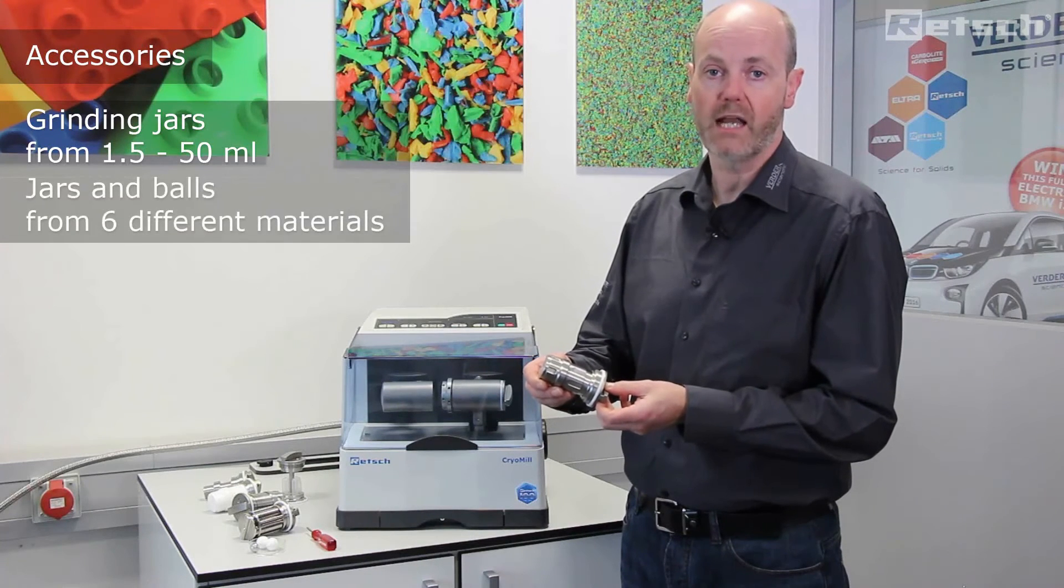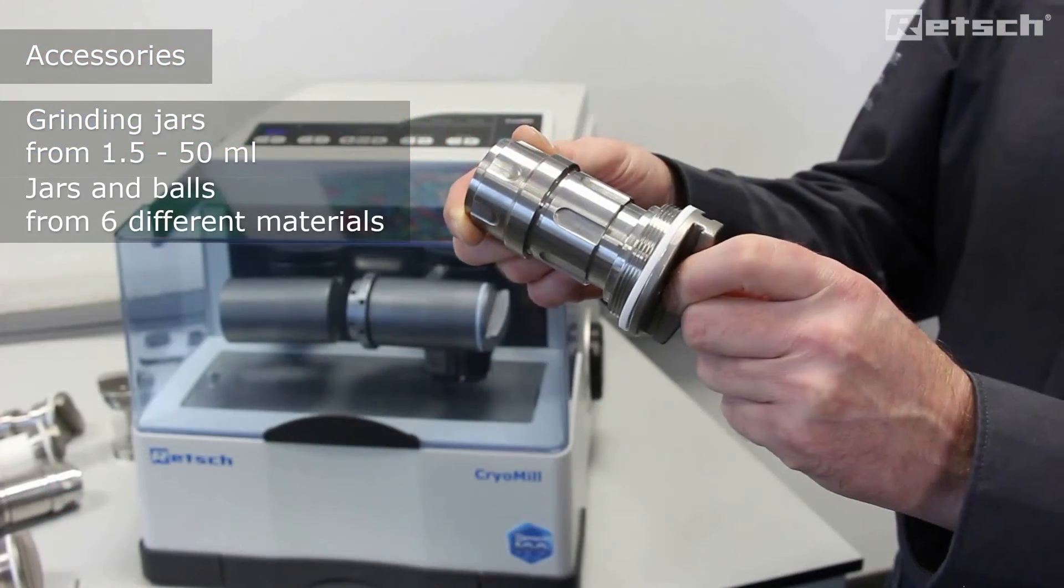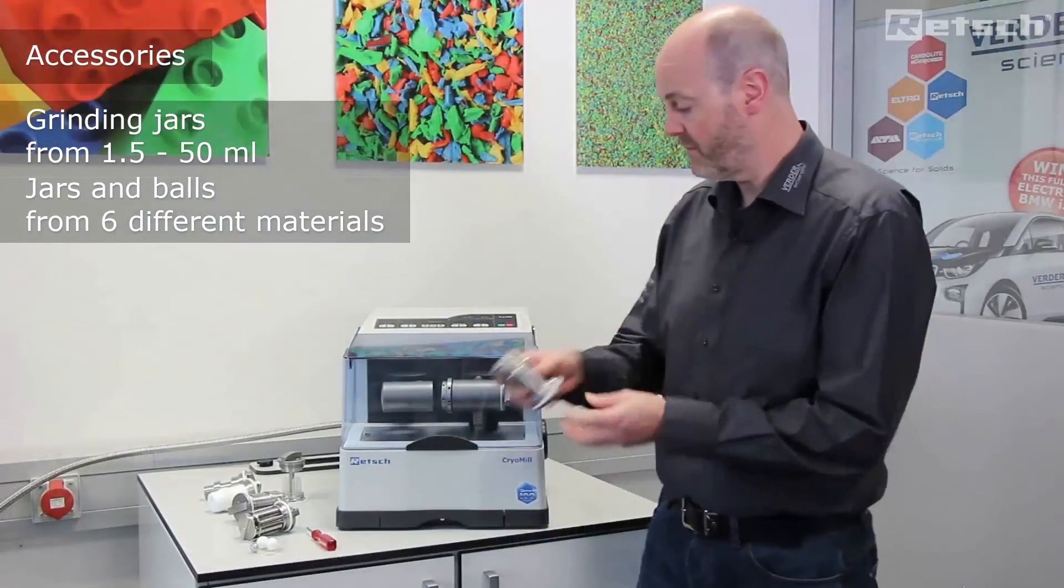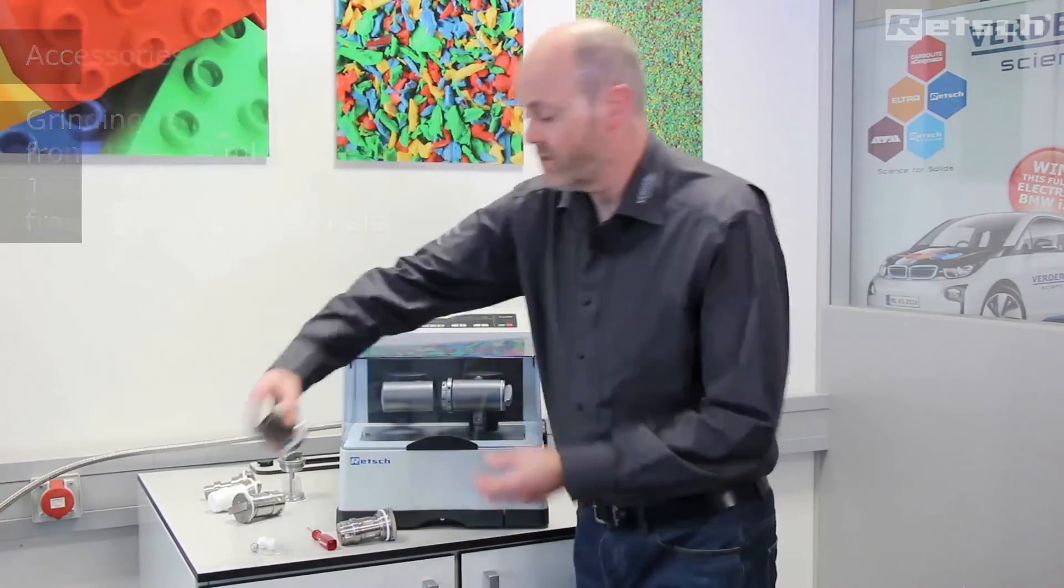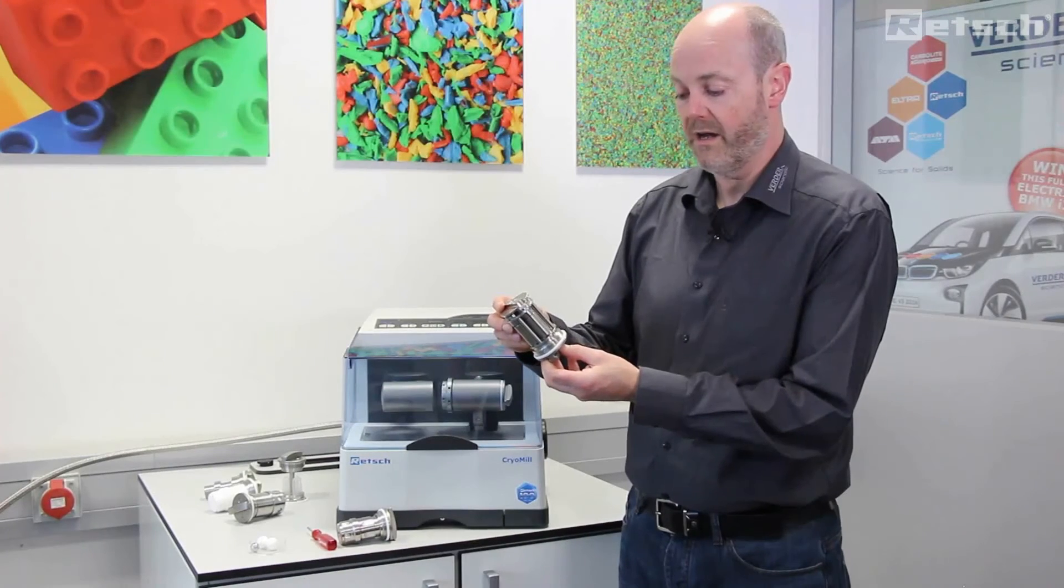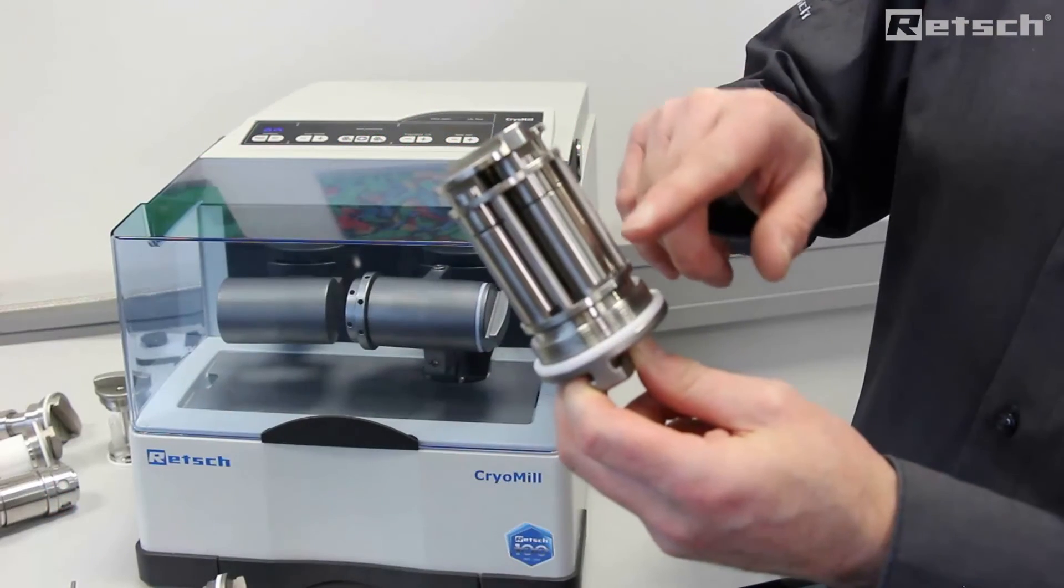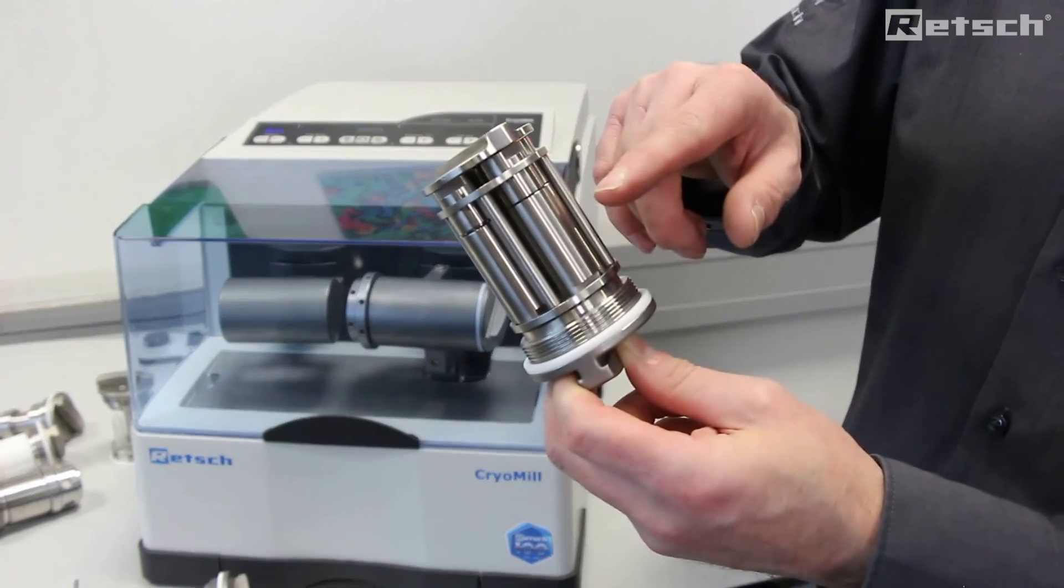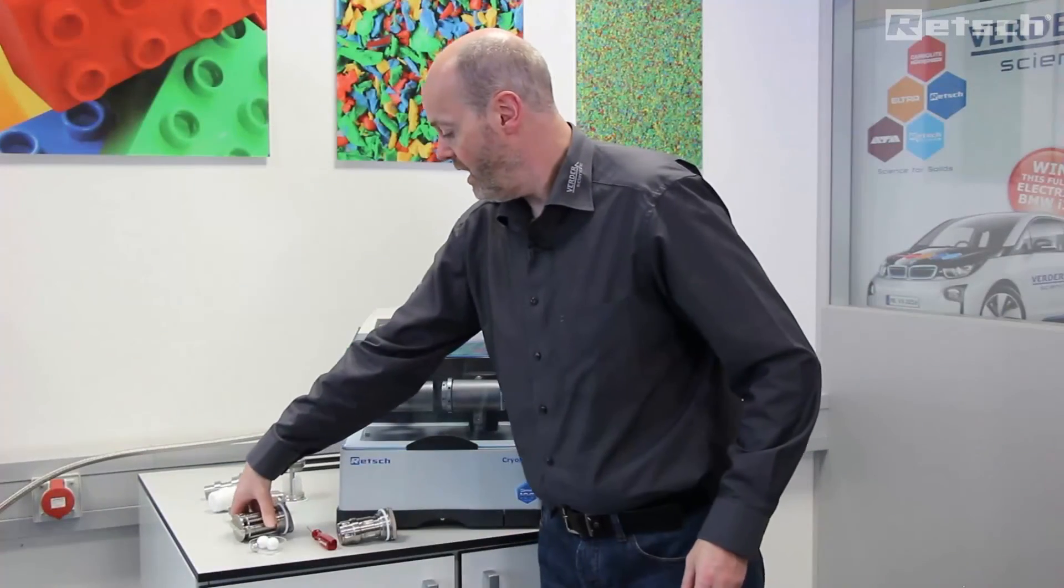The largest size as we show here is the 50 milliliter, and we go down to grinding jars as small as 5 milliliters. In this instance we have an adapter whereby we can run either 2 or 4 samples of this size simultaneously to facilitate a much larger throughput rate.